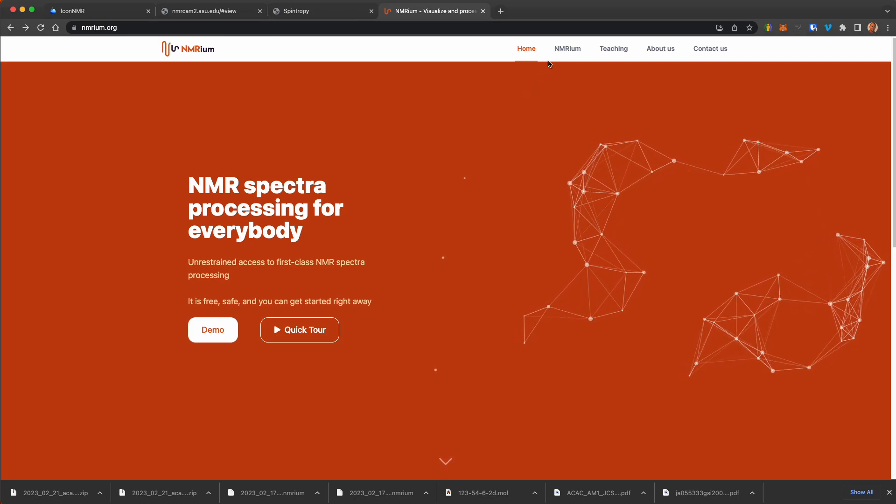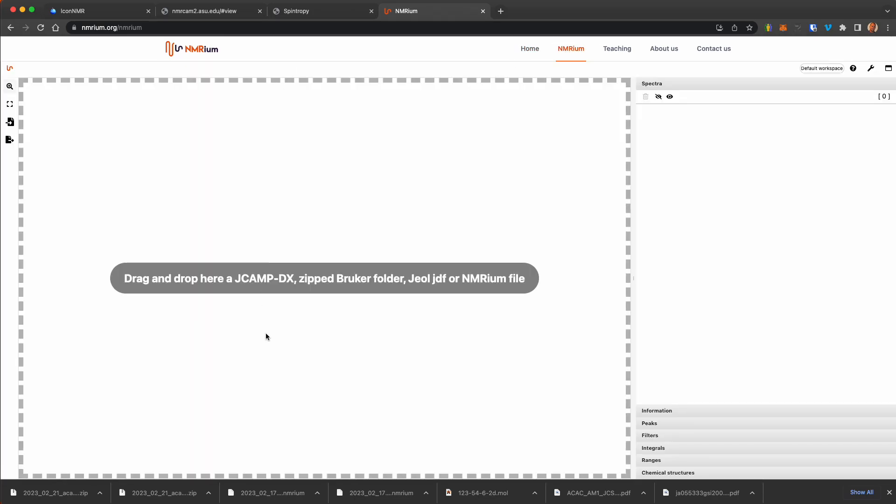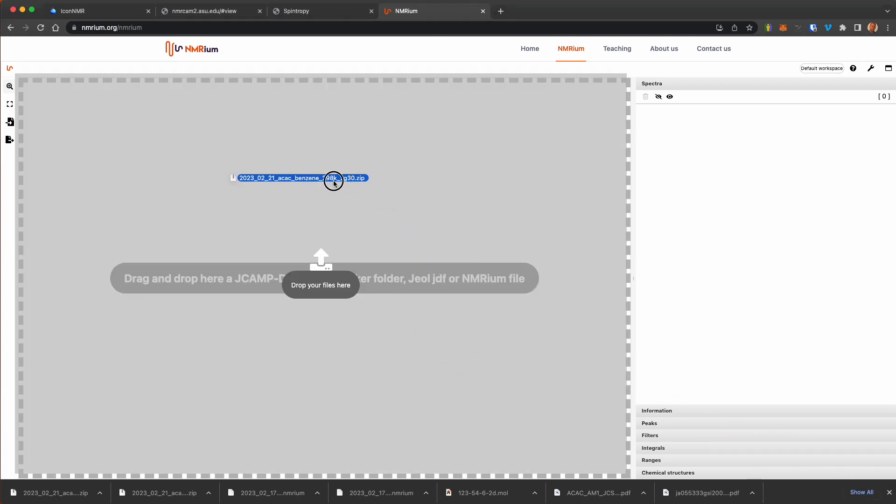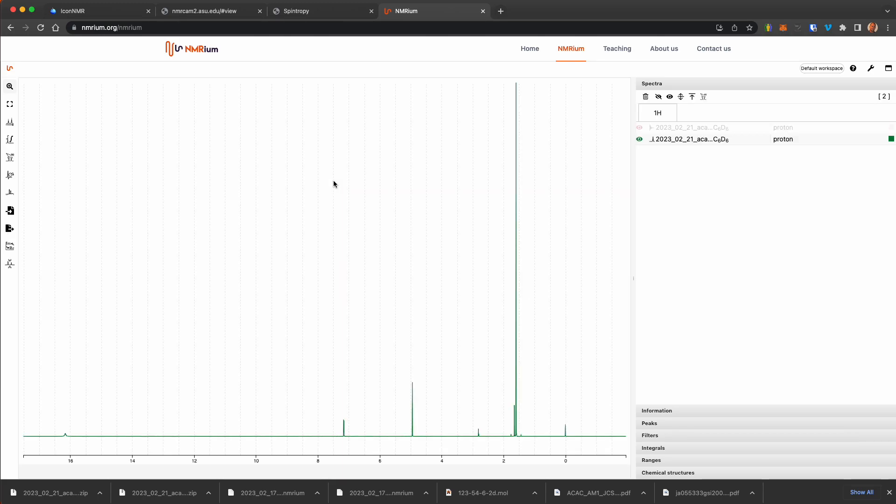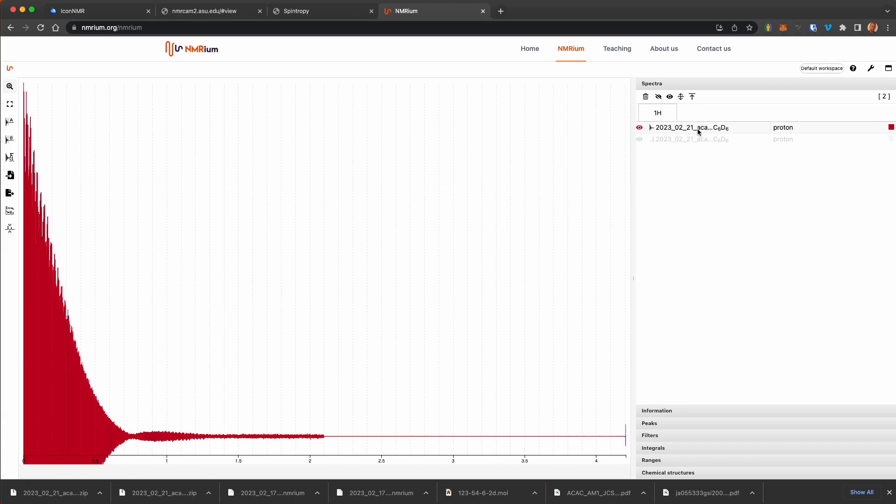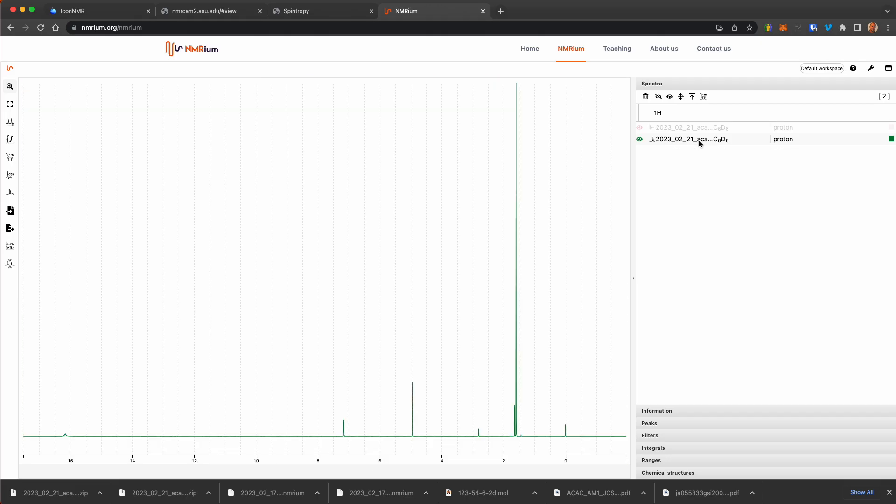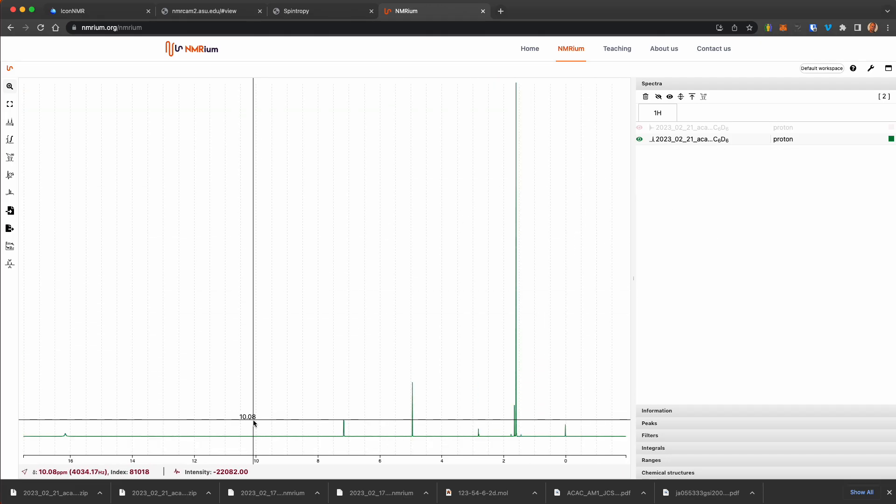So if we go to NMRium here, it tells you you can drag and drop the file that we just downloaded. It went to my downloads directory, so I'm just going to click and drag that zip file, drag it here, and it has the original free induction decay as well as the Bruker automated process data that it shows here.